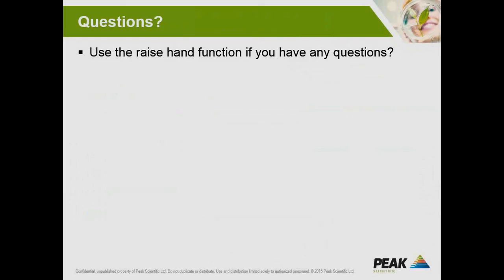Sure. I think we're really running out of time. We'll take the last question from Mr. Nilesh. He says, is the gas pressure for the gas cylinder the same as for the FPD, the ECD detectors? The pressure. Gas pressure. Yeah, the pressure. So the pressure from the generator is suitable for any other detectors, yeah.